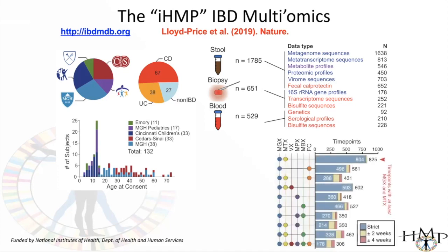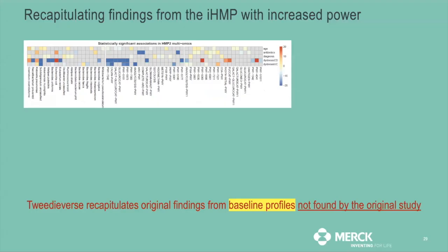The point here is that this is a multi-omics data set, but there are also challenges: you don't have too many complete pairs. Usually you have pairwise data available for many points, but not complete pairs. Even so, we can use this data set because we are not doing any paired analysis. But we know that if we want to connect the dots for two layers, and also across multiple layers, we may not have the same sample size across comparisons. Since this is a rich data set, we wanted to test whether we can recapitulate some of the findings in the original paper.